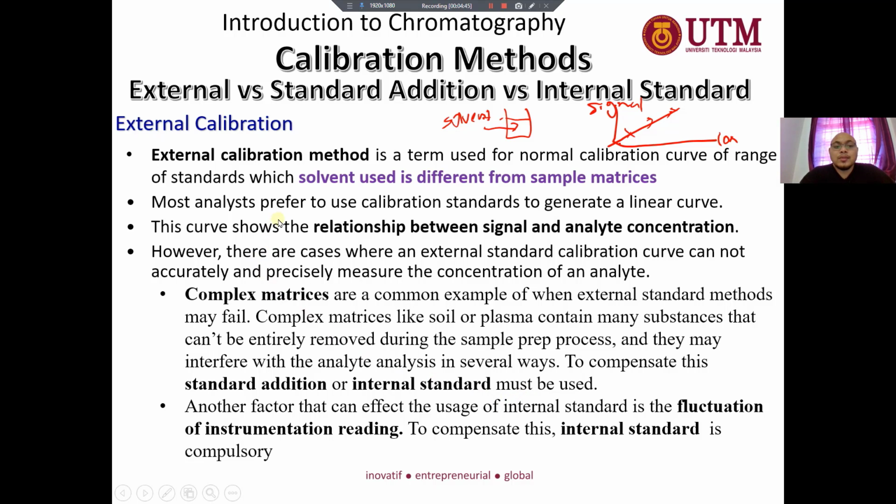So in some cases, we can use the external calibration when the matrix is not that complex. It means a matrix such as tap water or river water that is not so cloudy, not so contaminated, for example. Okay, we got water.